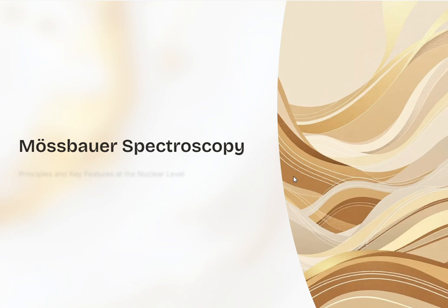Spectroscopy. So Mossbauer spectroscopy is not like every other spectroscopy. There are some differences here. As usual, we know in a spectroscopy there will be a source. The source might be an electromagnetic radiation, and this will be ejected to the sample, and then it will be transmitted to a detector. So this is the working principle of a spectroscopy.